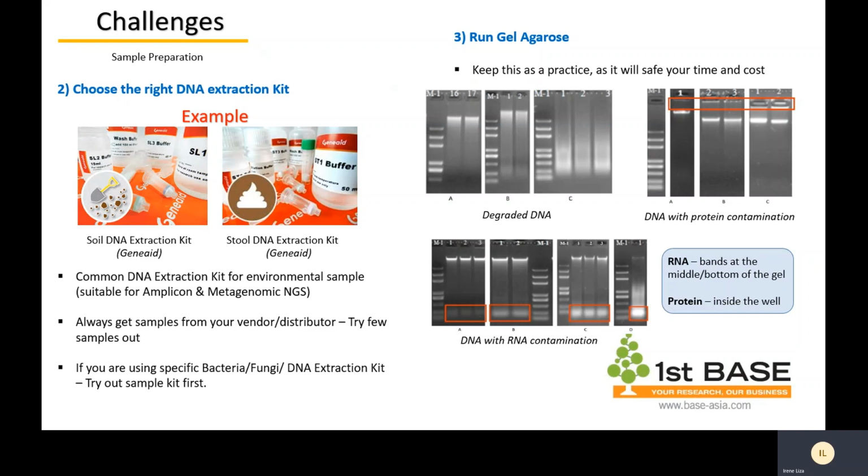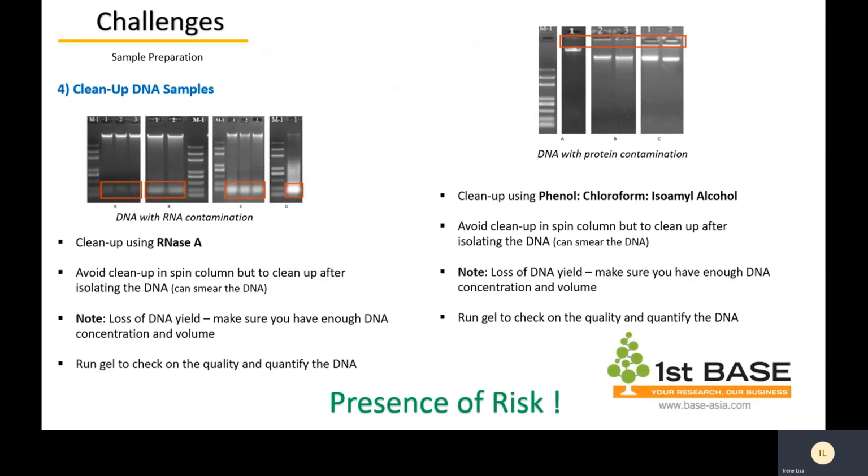So this is the common DNA profile of the gel images. Okay, so RNA will be at the bottom or the middle, while protein usually is stuck inside the well. Now, how do I clean up these particular samples?